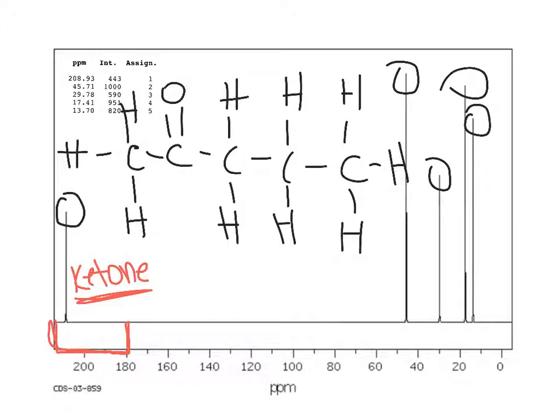It's also pretty clear that we definitely don't have an aromatic molecule, because if we did, we would have signals falling between around the 140 to 100 parts per million range, and it's pretty clear that we don't have any signals in this range. And it's pretty clear over here that these carbons all fall within the range of sp3 hybridized orbitals. So that's going to be the other carbons in our molecule that we've drawn. So here, here, here, and here.